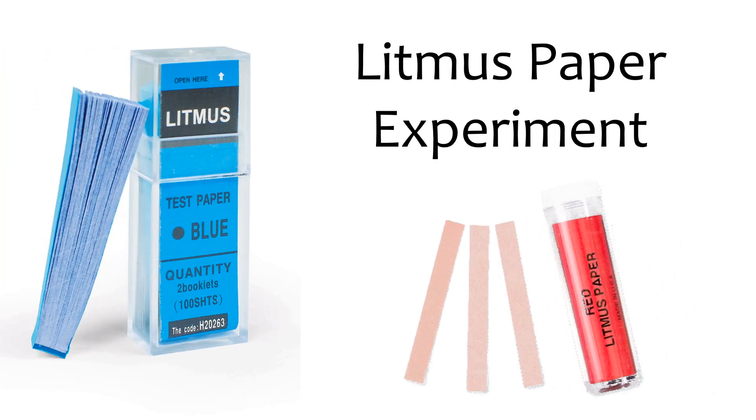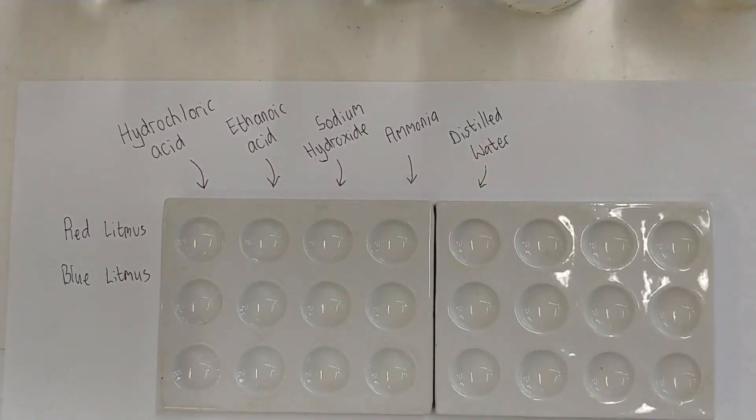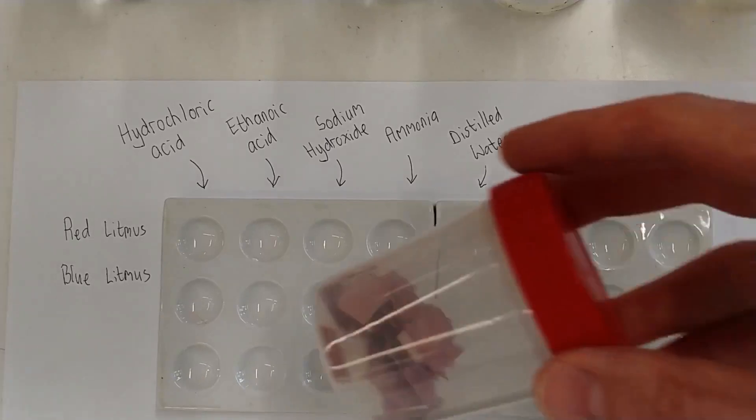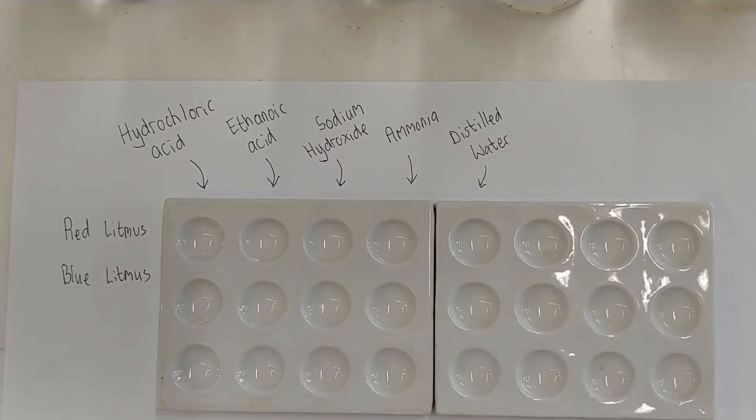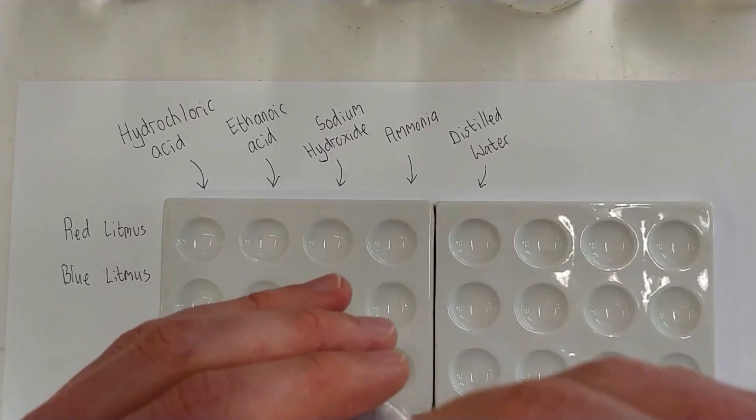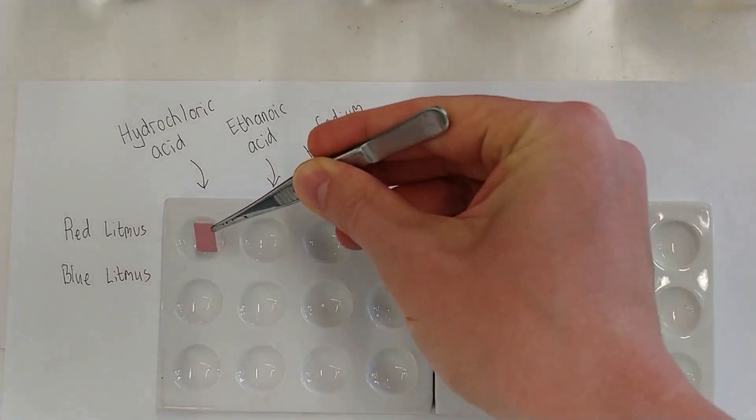Okay. In front of you, you can see the two spot plates, and we're just about to set up the experiment by first putting some of the red litmus paper on the top row.